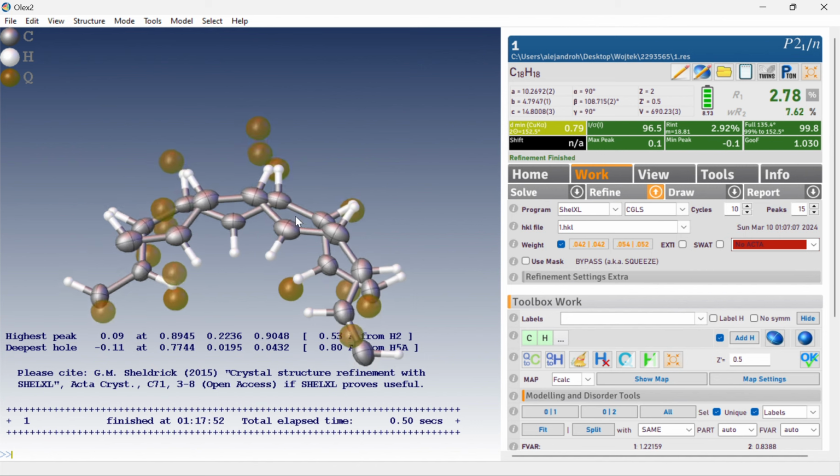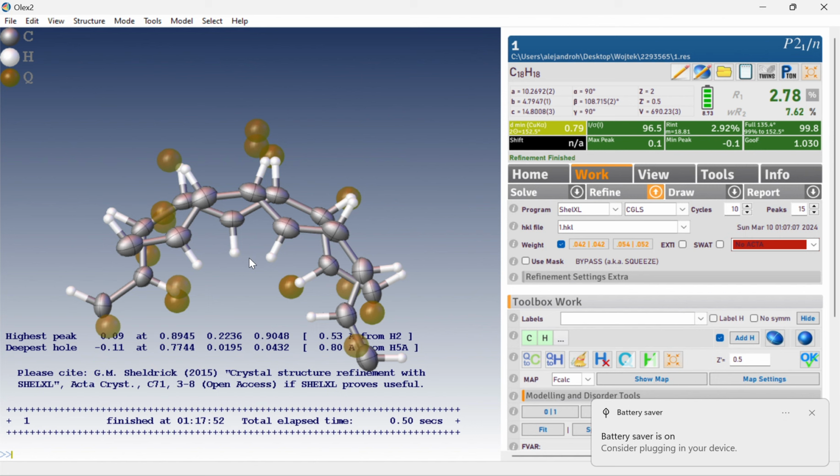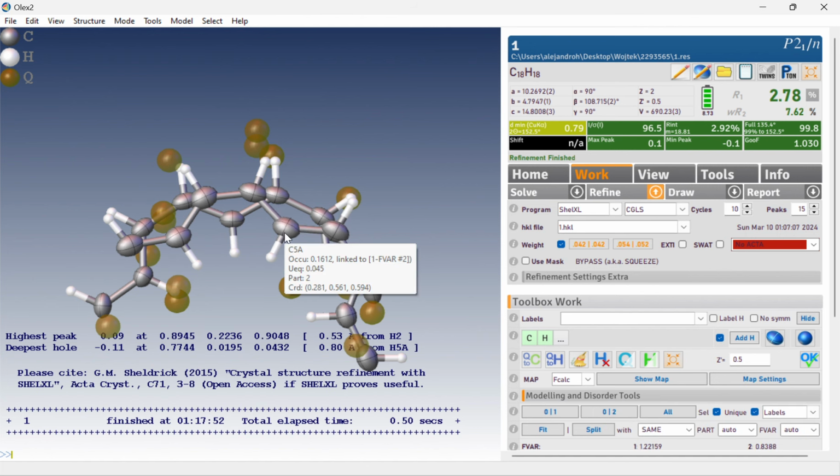And what we did was we had quite a large disorder. We had whole molecule disorder. And we restrained everything, both disorder components anisotropically. And one could argue that because the ratio of the two disorder components is so different, here is 83%, the smaller one is like 16%, so the electron density related to the minor disorder component is very small.